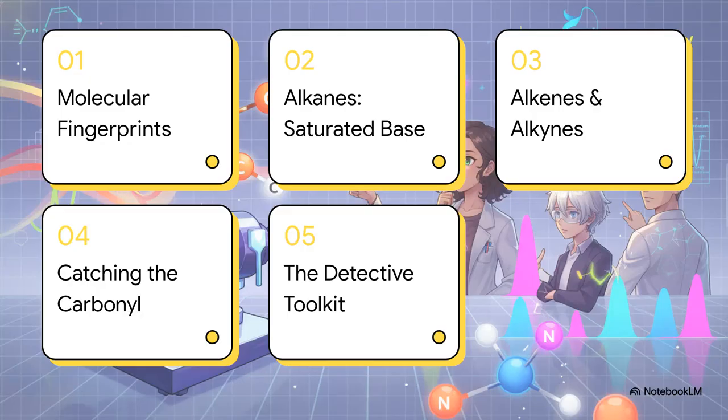So here's our roadmap. We'll start with 1, decoding molecular fingerprints. Then move into 2, alkanes, saturated foundation. After that, 3, alkenes and alkynes, adding bonds. Followed by 4, aldehydes, catching the carbonyl. And finally, 5, the detective toolkit.